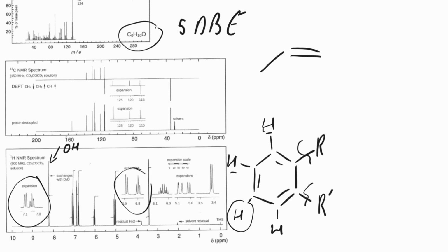Now, to try and decide which end of this propene is attached to our ring, I'm going to look at the carbon-13 spectrum, specifically the DEPT.